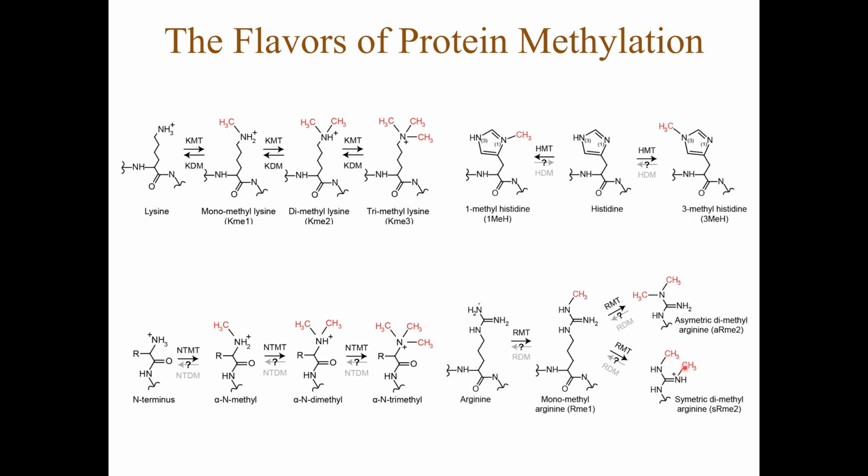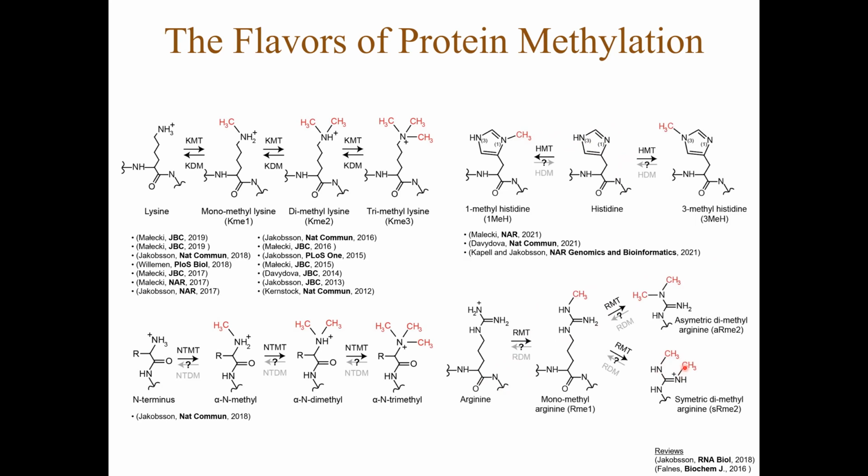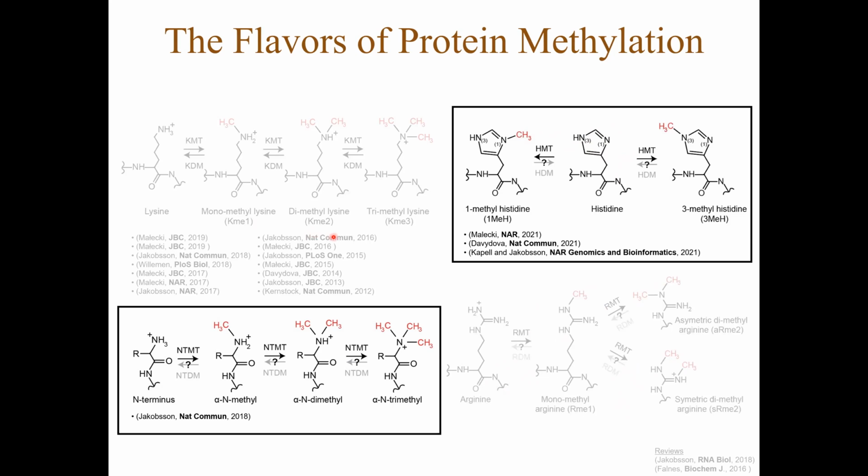And we have been studying these methylations quite broadly, and here's a summary of the papers I have been involved in as a PhD, postdoc, and PI. So most of our work concerns lysine methylation, but more recently, I have worked with methylation of the protein N-terminus and methylation of histidine. And these modifications are a bit more exotic and emerging, and I thought that they were a good topic for this eMERGE seminar series.